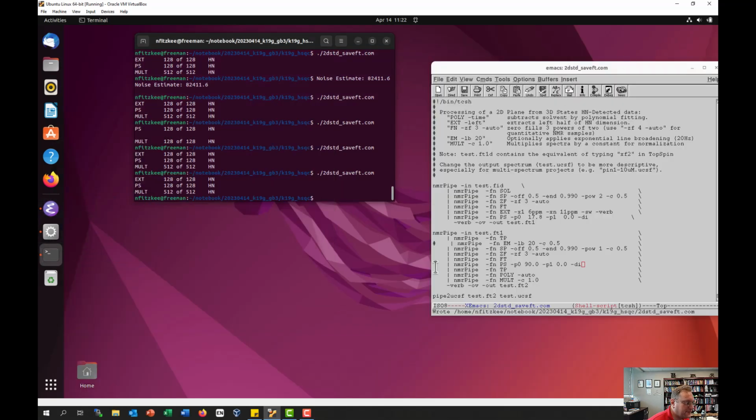The peaks look like they're well organized. And maybe in a future video we might talk about how you might change the apodization, right? So this is a sine bell multiplication. This is a sine squared, right? So both of these are SP for sine multiplication. And then the power 2 here means that this is sine squared. The power 1 means this is just sine. And then the ending value is 0.99. And so this sort of specifies where you start and end in the apodization.